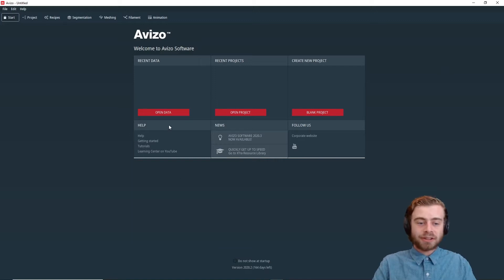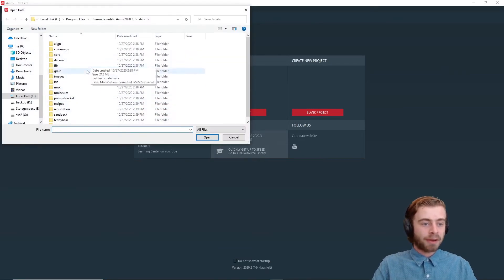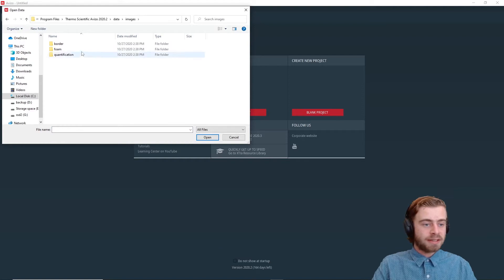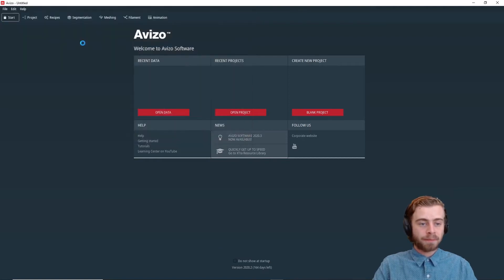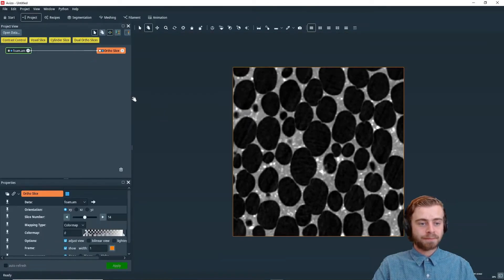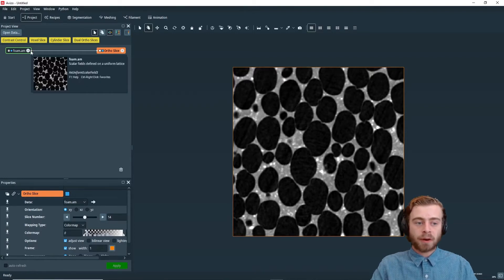All right, so to start out, we're going to click Open Data, and we're going to go to Images and then Foam, and we're going to Open Foam.